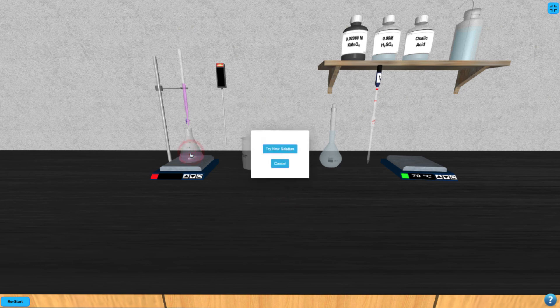When finished, you can click on the Erlenmeyer and click try new solution to repeat.